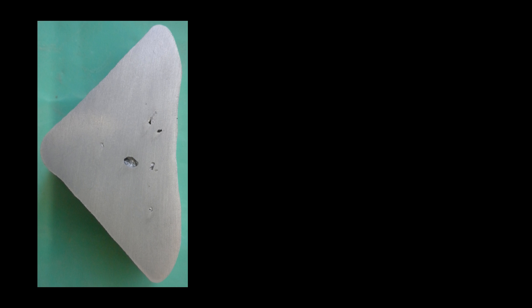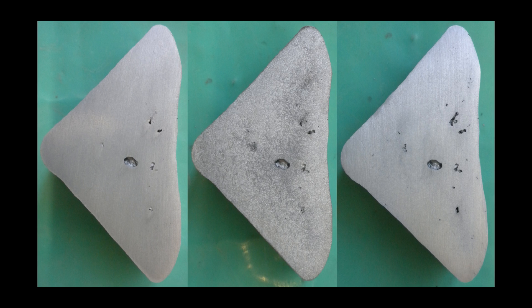And here is the other side of that slice. First of all again the as sanded, you can see some of the porosity, then the etched with the grey area in the middle it was last to freeze and the porosity is a bit more obvious and then finally the etched and sanded afterwards and we can see a lot more of the porosity again.